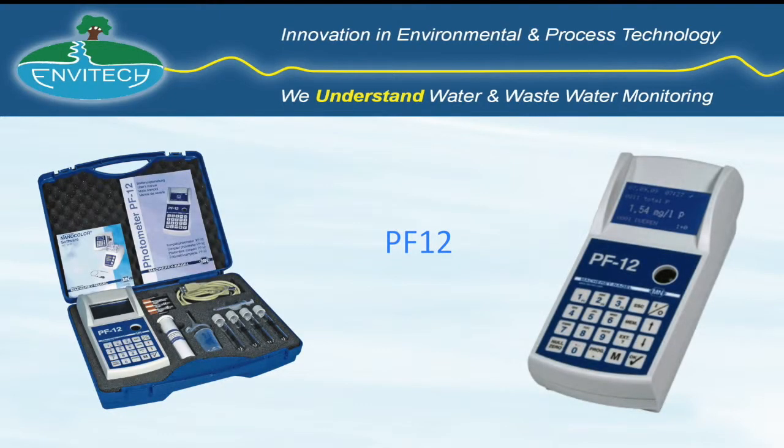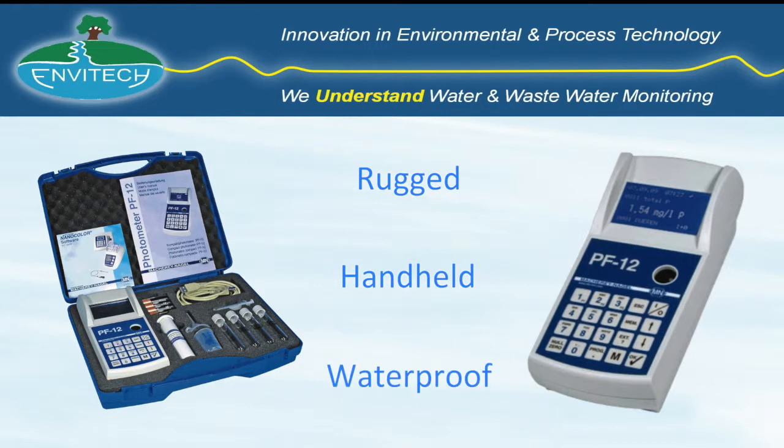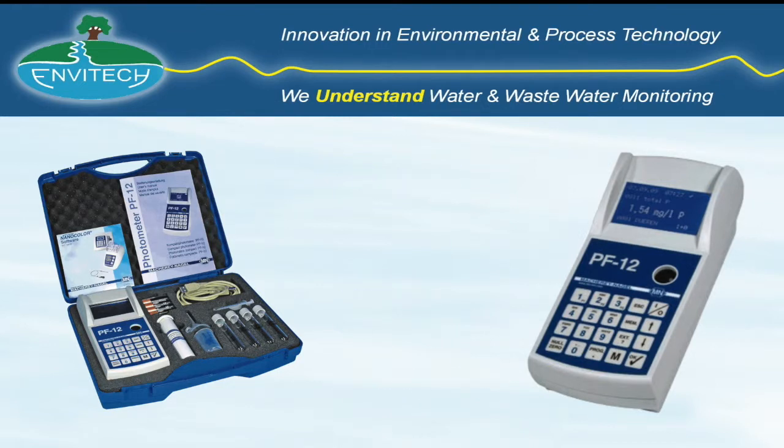The PF12, manufactured in Germany by Macherey-Nagel, is a rugged, handheld, waterproof photometer suitable for water analysis in the field or site laboratory.